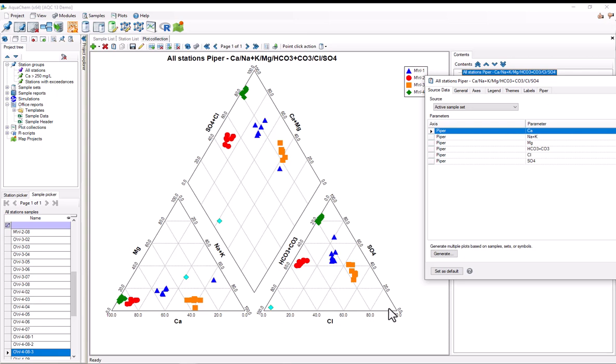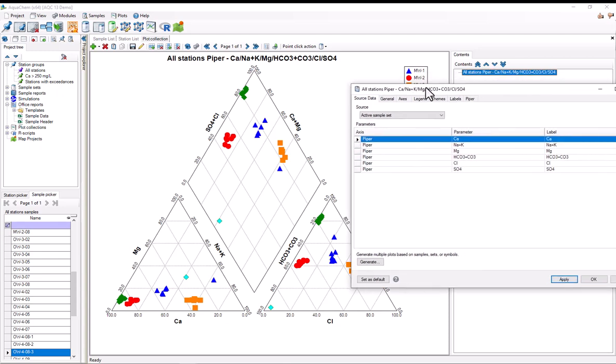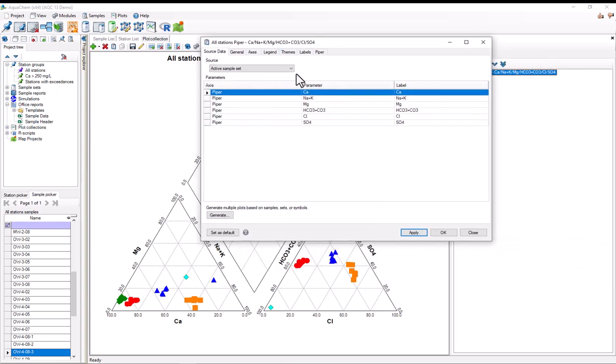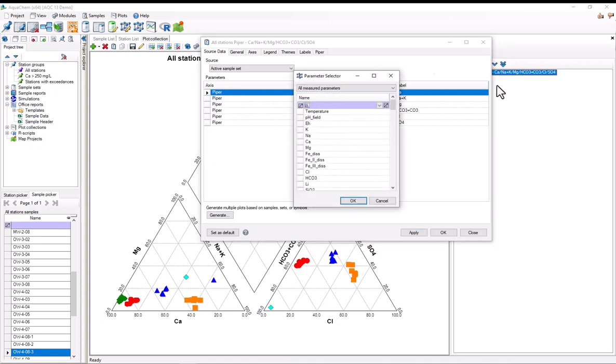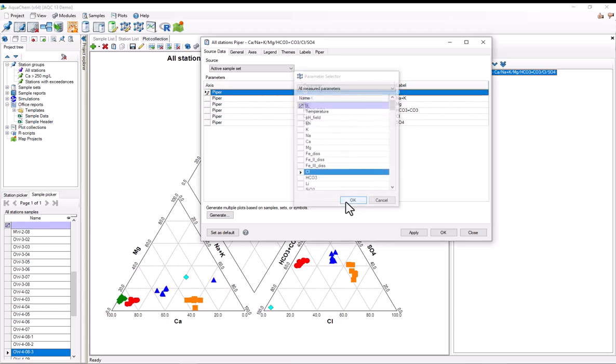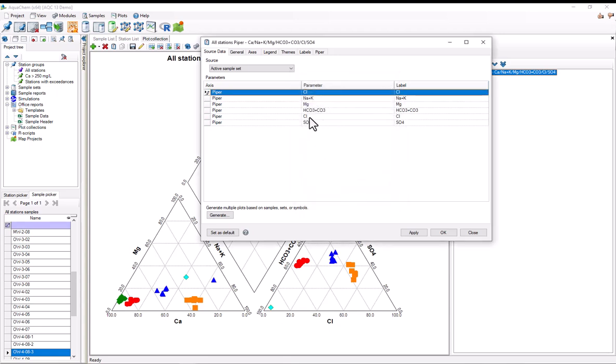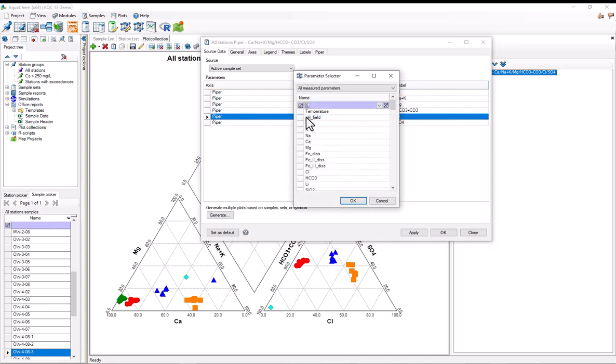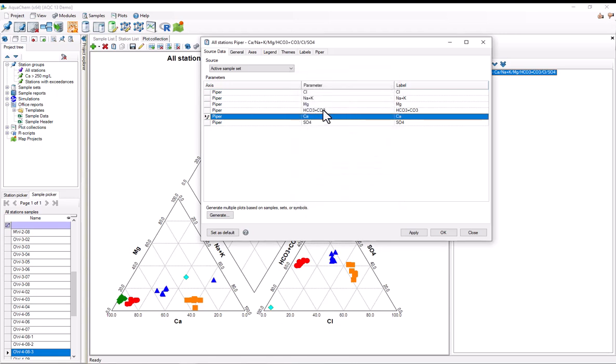Suppose that I wanted the anions on the bottom left and the cations on the bottom right. To do that, all I'd need to do is switch the parameters on the axes table. For example, to switch calcium and chloride, I could simply select calcium, which will open up the parameter selector. I'll find chloride, hit OK, and now that's been added, and I'll need to switch chloride as well. I'll select chloride, find calcium, select it, hit OK. So, now those two have been selected.